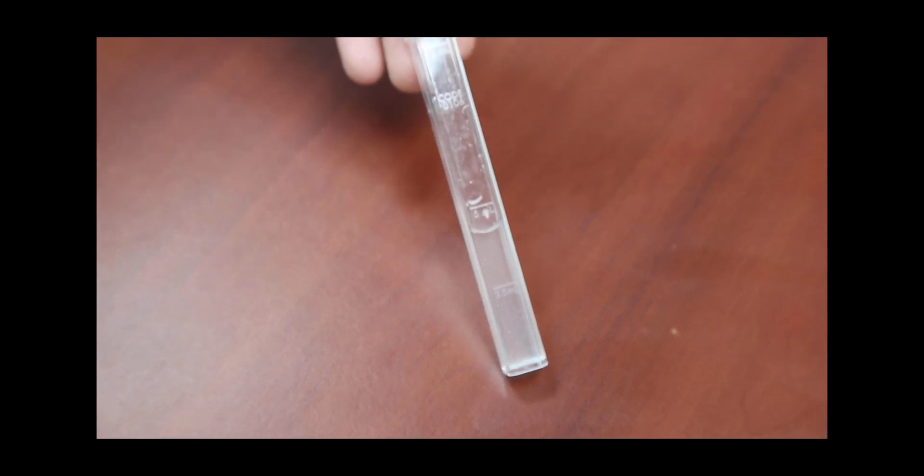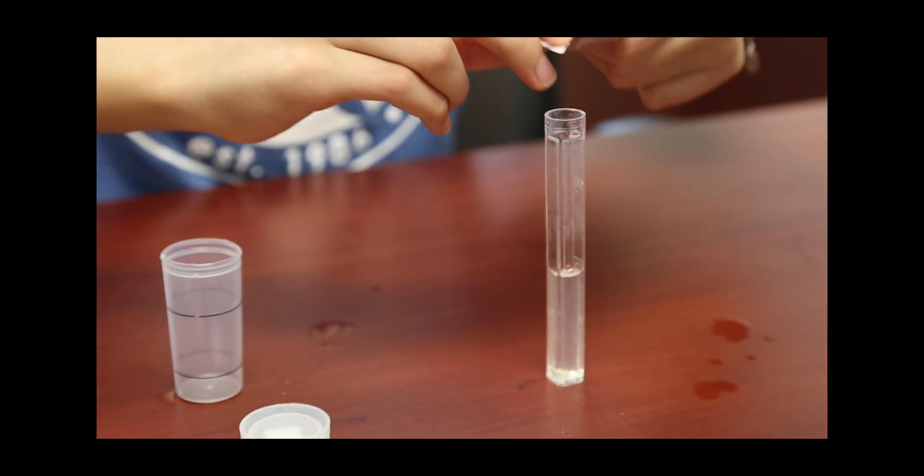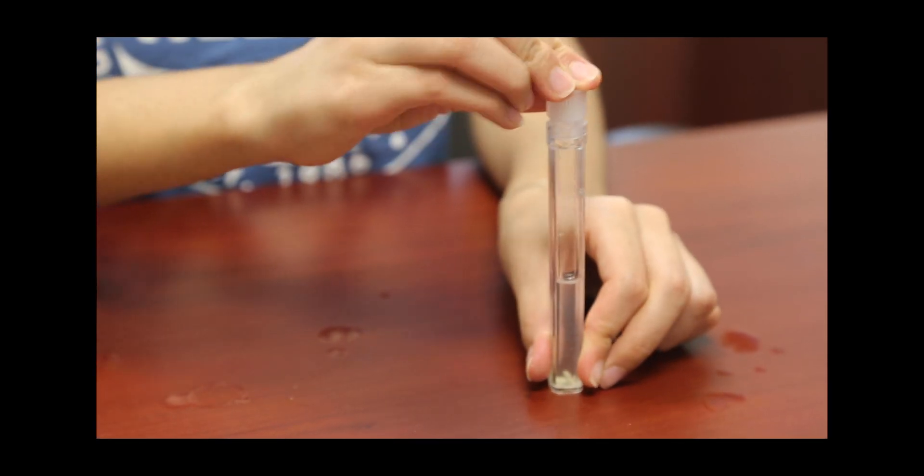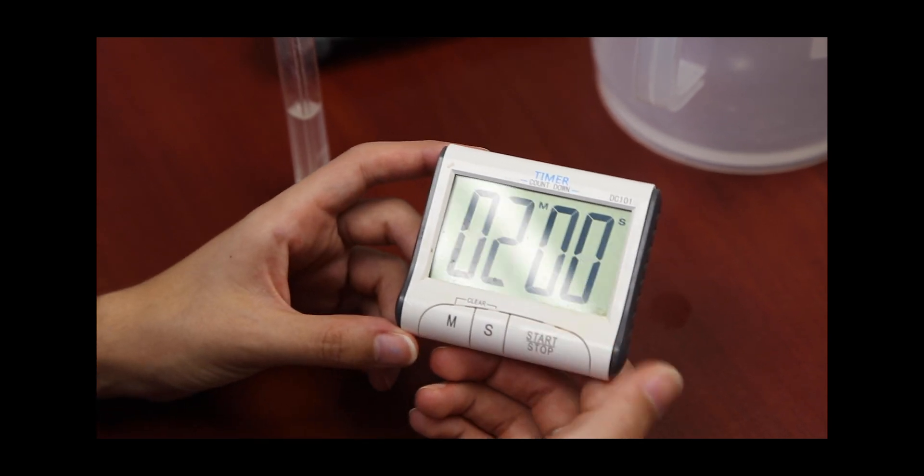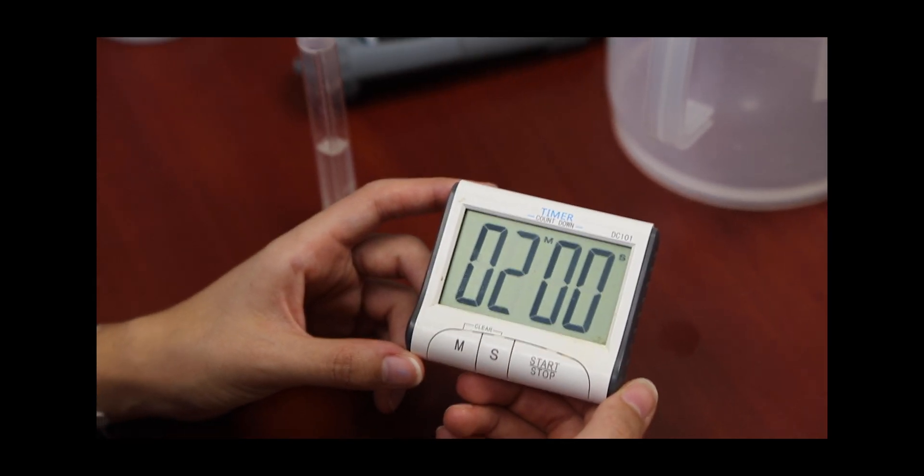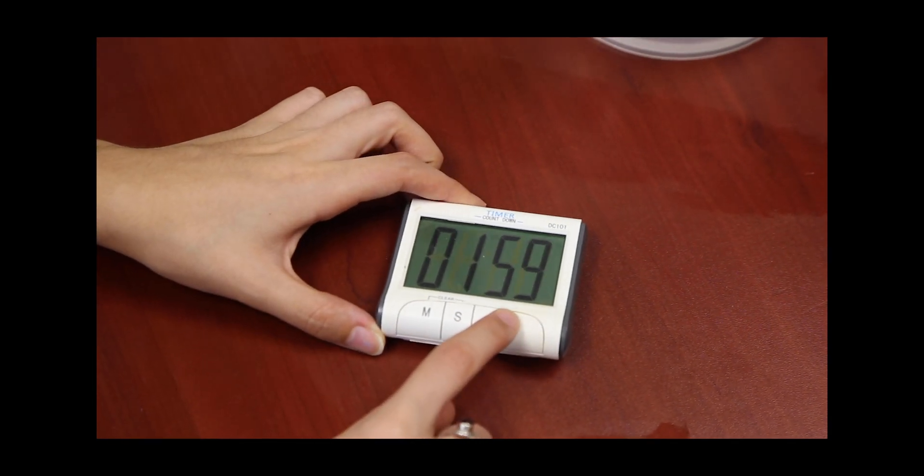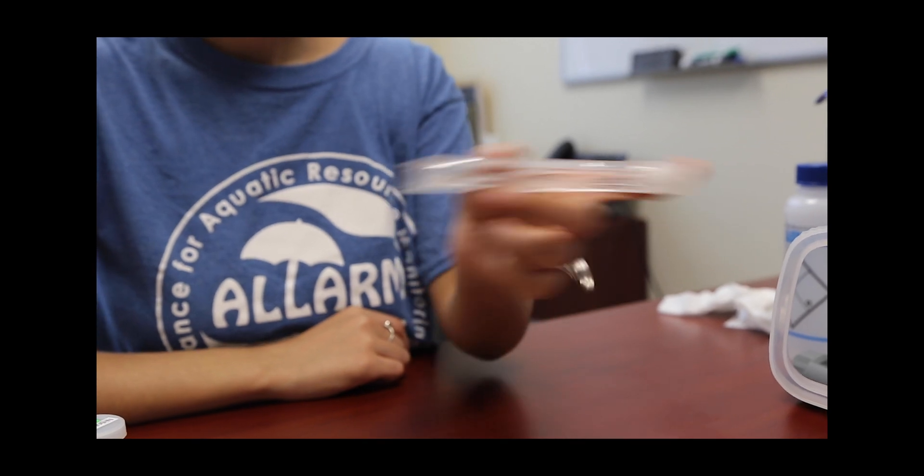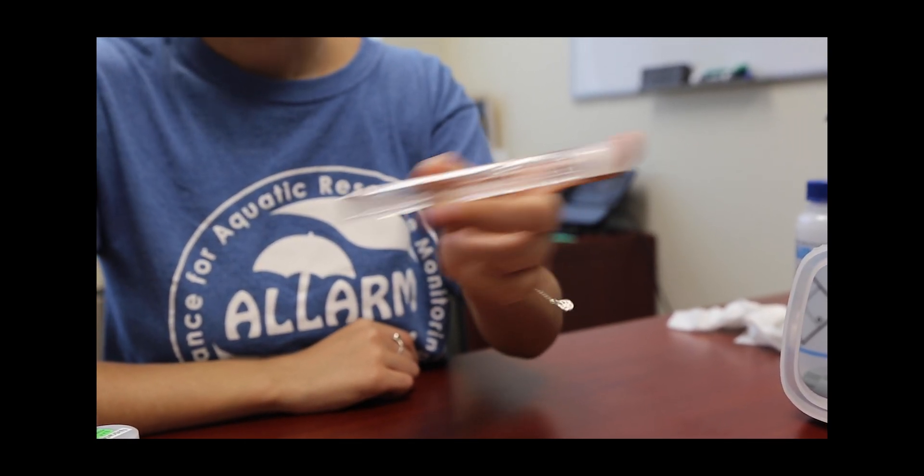Once your tablet is dissolved, add Nitrate Number 2 tablet to the test tube and cap it. Grab your timer and set the time for 2 minutes. Shake the test tube continuously to dissolve the tablet. Try to shake in a consistent manner for 2 minutes.